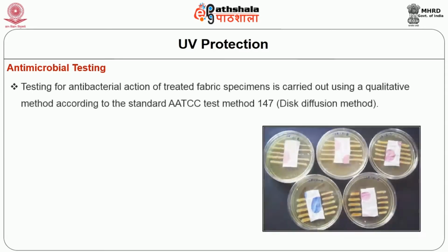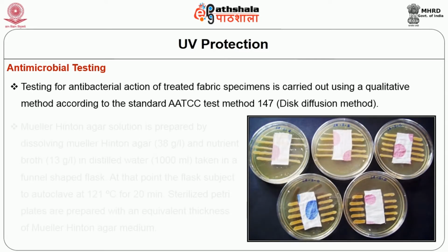Antimicrobial testing. Testing for antibacterial action of woven fabrics which are specially treated with natural substances or chemicals.